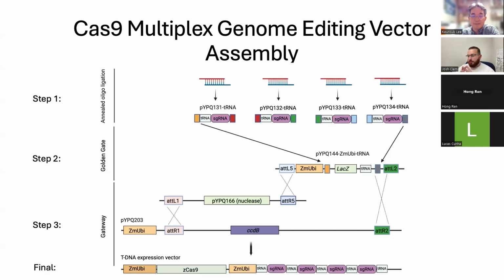I also avoid highly repetitive polynucleotide sequences. So I wouldn't want to have, say, 4 Gs in a row for a number of reasons.